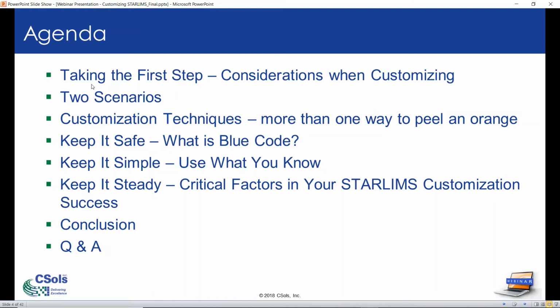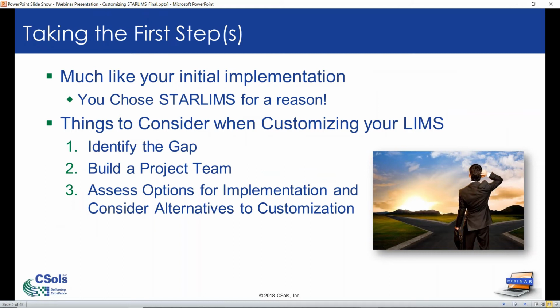Okay, what's the first step? Making the move to customize an existing LIMS is not that different from your choice to implement one in the first place. You have some needs that are not met, and you need to decide what to do about it. You probably have a few choices you can make about the approach you take: new configuration, new software, or customize what you have. The differences in these options can be stark, but a considered decision on your potential changes should include a discussion of each option.